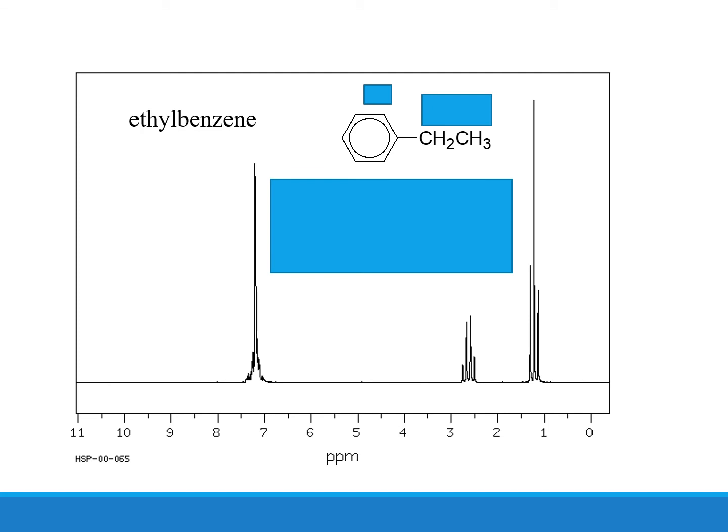Here is an exercise. It's not such a difficult exercise, but try to see how many peaks you can find from this ethyl benzene? Of course, 3 peaks, because it's already displayed there. But how do you relate the quartet and the triplet and the singlet splitting here?